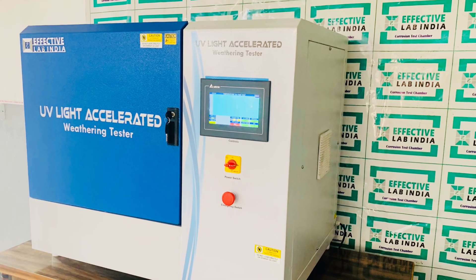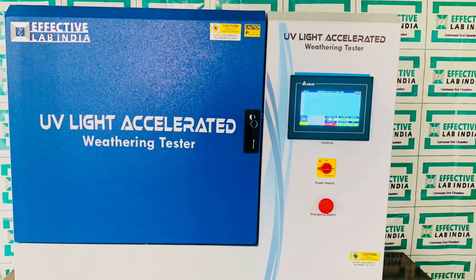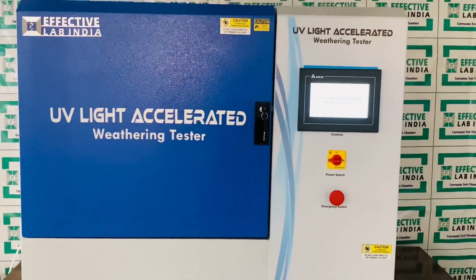In this video, we are going to learn more about UV weathering test. UV weathering test chamber creates artificial weathering conditions with a combination of ultraviolet radiation, moisture, and heat.